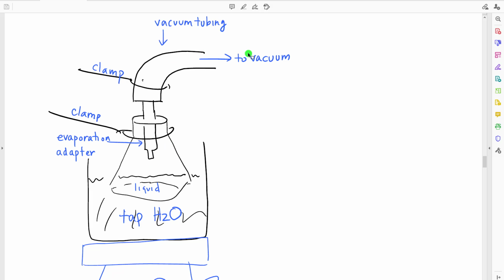Because we take that vapor away very rapidly, instead of waiting for it to diffuse out of the top of the system, the liquid will then begin to evaporate more rapidly, since it will be very aggressively and rapidly trying to replace the vapor that's being lost. This will cause the overall evaporation process to speed up greatly.